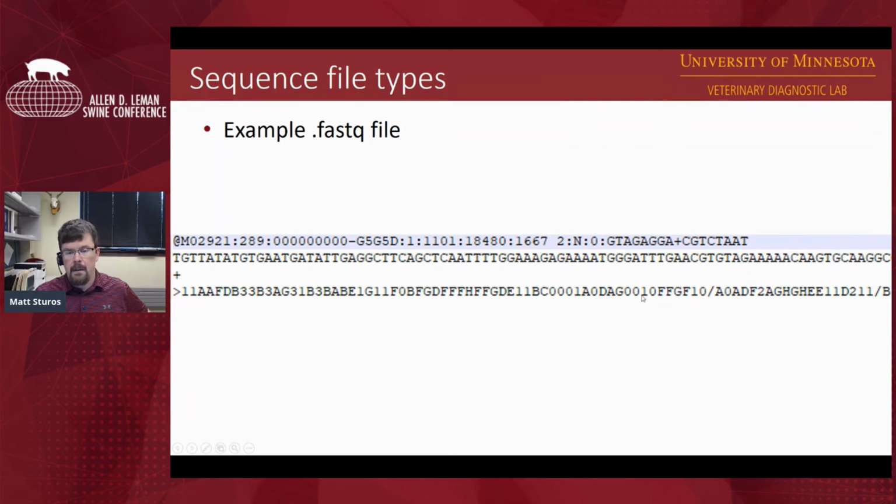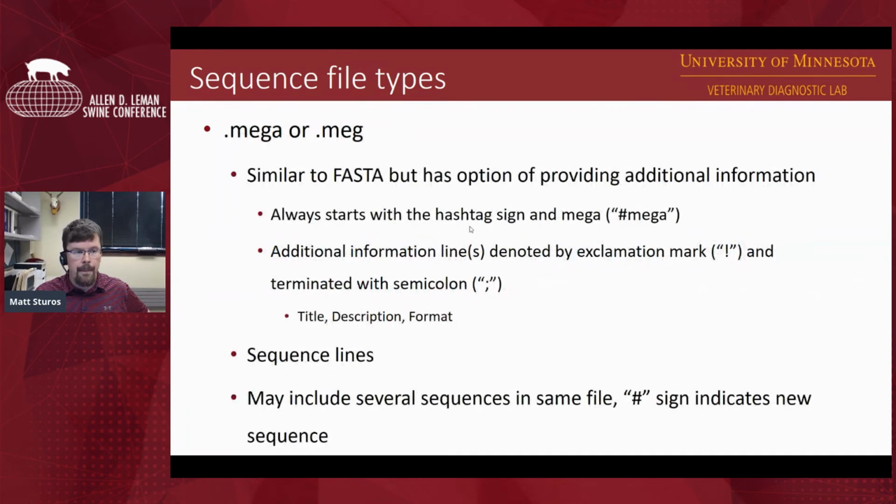This looks like a foreign language to me, but the computer knows what to do with that information. Another one that you'll see if you're using MEGA, some software will allow you to export it in MEGA format. It's just another way to format it. It's similar to FASTA, but has more information that you can provide. This will always start with a hashtag and then MEGA.